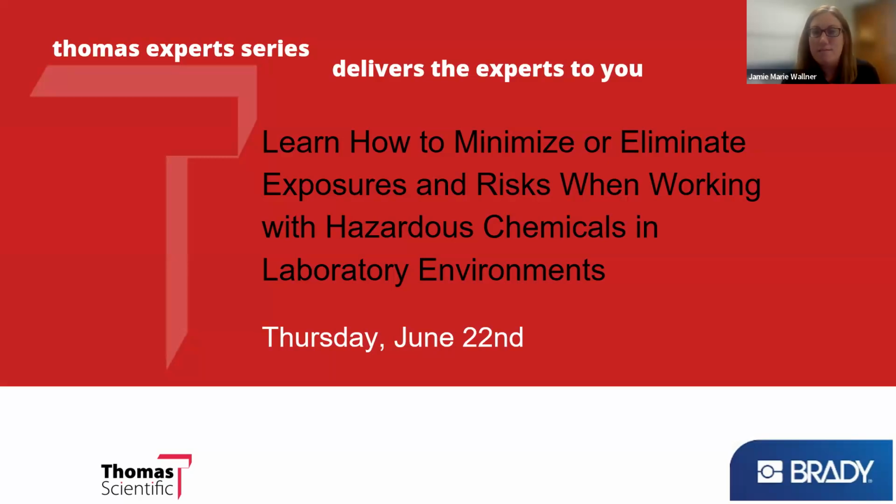Your CHO needs to have relevant lab experience. They're going to be responsible for putting together your chemical hygiene plan and reviewing it on an annual basis. Your CHO may not be your EHS person. Here at Brady, I am not the CHO. One of our lab managers is the CHO. And when I was in an EHS capacity here, I worked very closely with them.